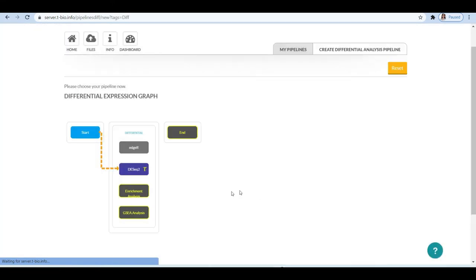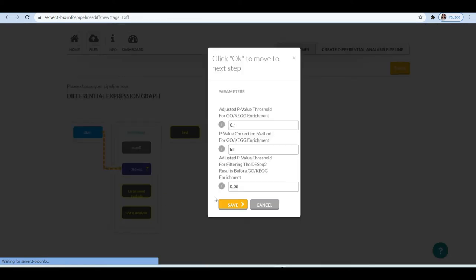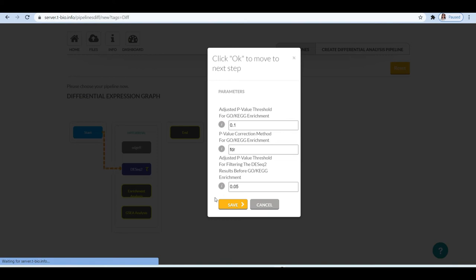Next, to understand the biological implications of significant genes, we will perform enrichment analysis and gene-set enrichment analysis. Based on the enrichment analysis, we will understand what are the important pathways in which our significant genes are enriched. Similarly, we will learn about the important gene ontology terms that are significantly associated with the set of significant genes. When you click on the enrichment analysis module, you will get a pop-up to set or define the parameters. The value for adjusted p-value threshold for GO or KEGG enrichment will remain 0.1. P-value correction method would remain FDR. And the value for adjusted p-value threshold for filtering the DSEC2 results before GO or KEGG enrichment will remain 0.05.